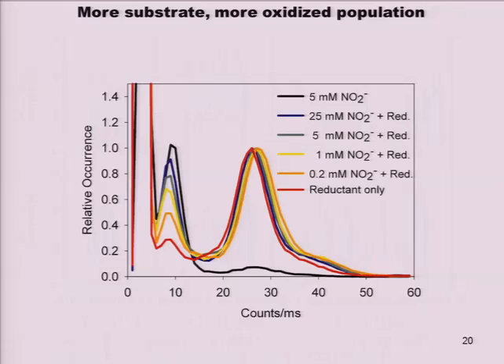Okay, so we can take this data. First thing we can do is we can make, again, single molecule people love big histograms. We can make a histogram of all the different intensity levels that we see, and now we can do a good sense check. If we're looking at an enzyme, we'd like the behavior of that enzyme to be in some way affected by the amount of substrate we put in solution. And here our sense check succeeds. As we start adding a higher and higher concentration of substrate, we start growing in a higher equilibrium fraction of that lower intensity peak. So great, we're not looking at something totally artifactual.